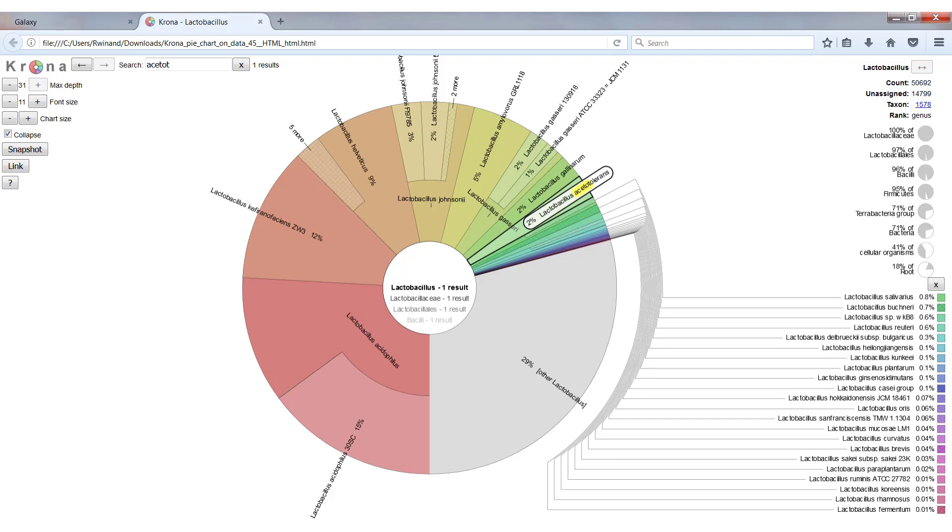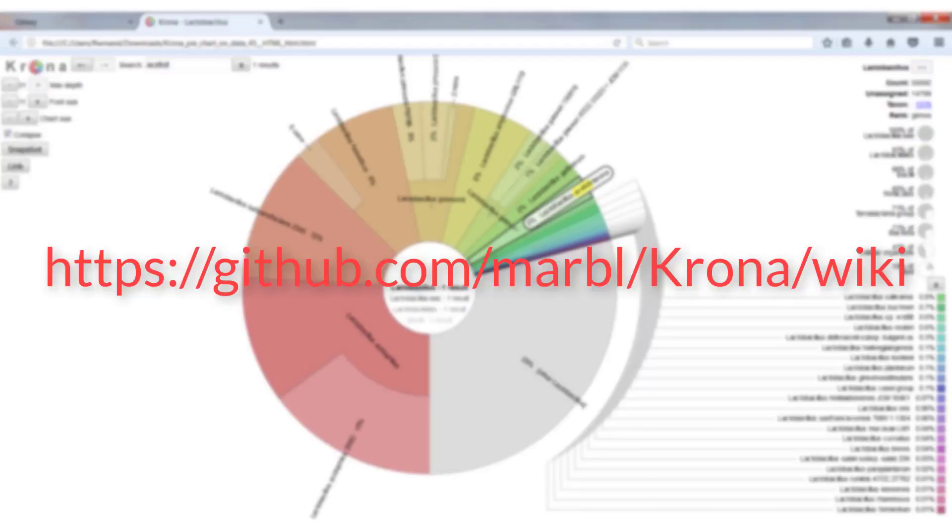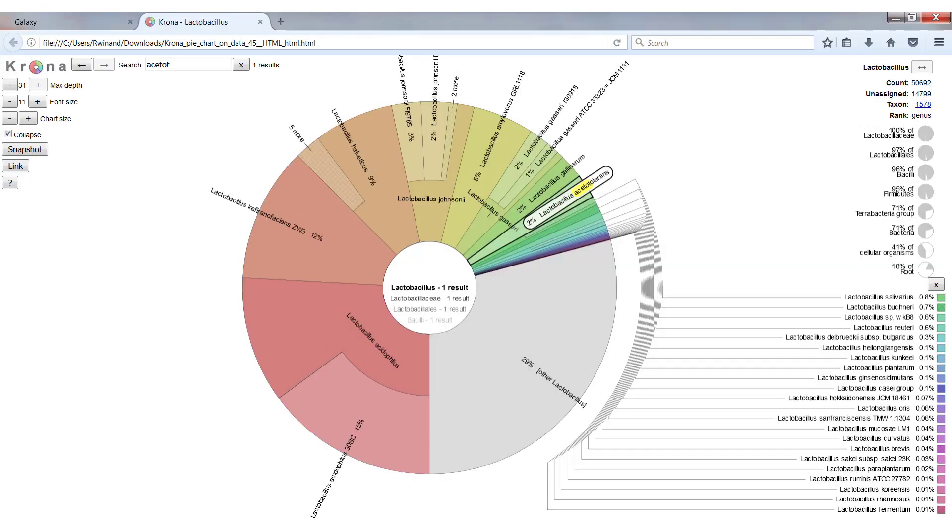It is also possible to limit the number of levels that are shown, to increase the font size, the chart size, but you can also create a snapshot to save this figure and export it to another program. If you want some more information on how to use Krona, please go to their GitHub page, where you can find a wiki and a manual that will explain it all.